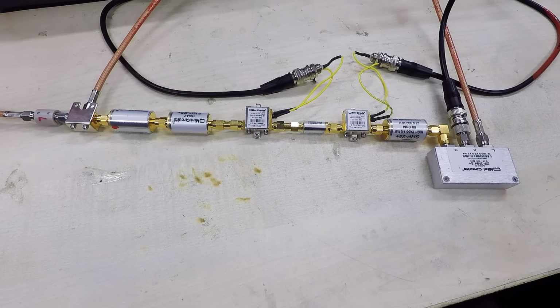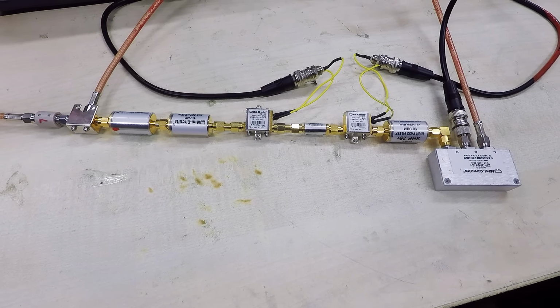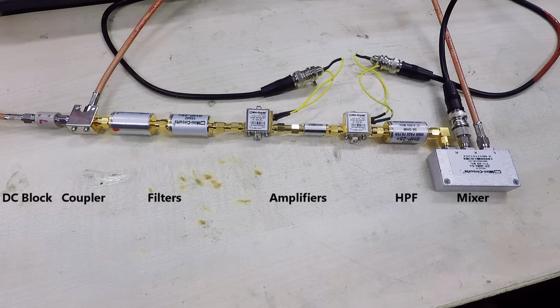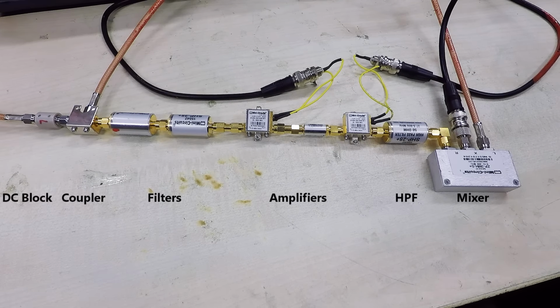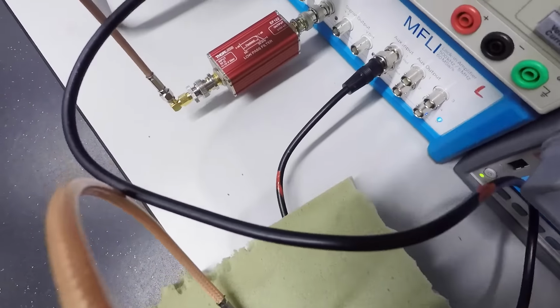So this is our filter and amplifier chain. You can see just on the left hand side there's a DC block. I didn't mention that on the circuit diagram, but we found that helps to further reduce noise in the system. So just to the right of the DC block is the directional coupler, followed, moving rightwards, by a high pass and low pass filter, two amplifiers, a further high pass filter and the mixer on the right. And finally we have another low pass filter on its way into the lock-in.